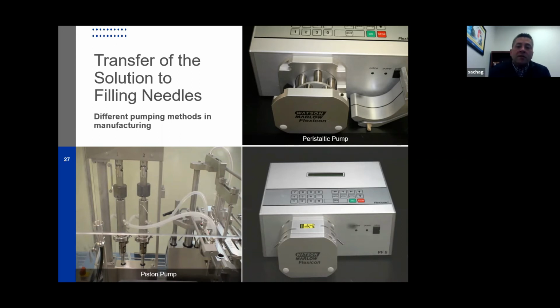Should we use polysorbates at their CMC concentration? By default, you already are. Most of these polysorbates have CMC concentrations that are very, very low. So you're automatically forming the CMCs.